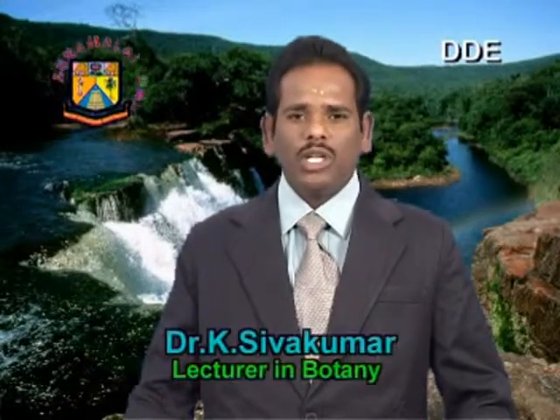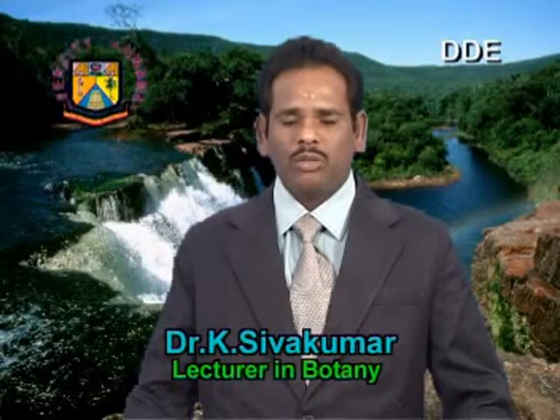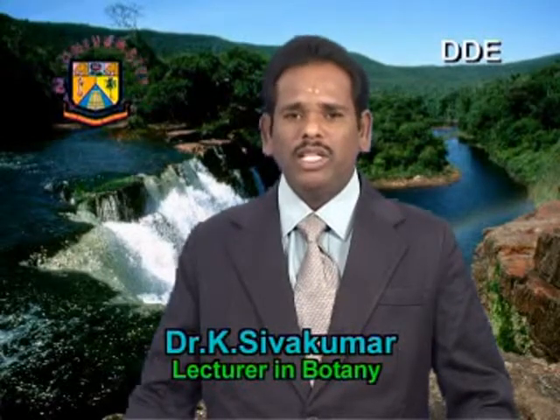Whether your prepared block has any damage or any porosity, or whether it is fully polymerized or not, everything should first be checked with the help of a stereo microscope. Once you are satisfied with the stereo microscope, then you can go for trimming the block.